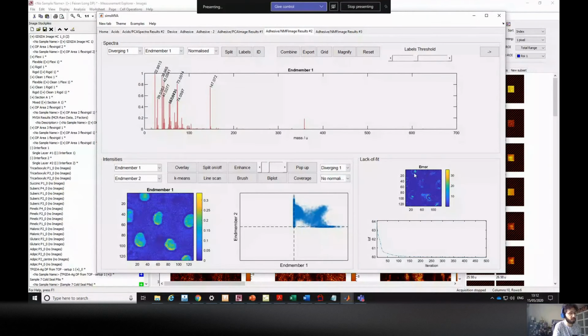And you can see we're not quite factorizing everything. So it's quite likely that we could have added another component, or another end member that would cover these things that are missing. So instead of 3, we would need 4. But it's all right. We can see what we got with 3. But it's important to check both these graphs here to see if your factorization is correct.